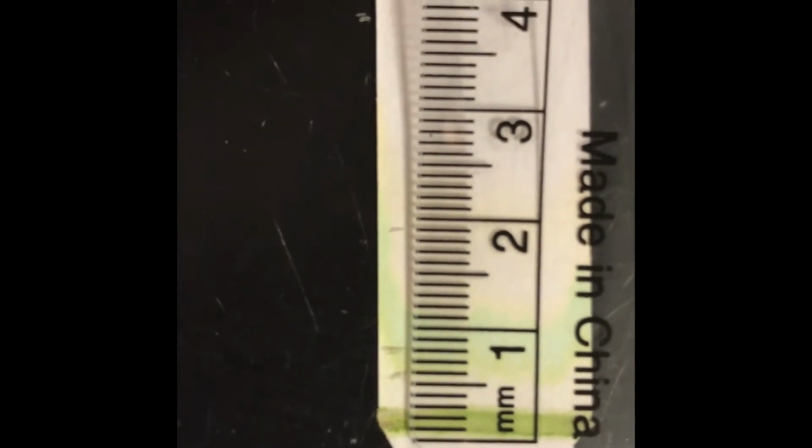Okay, the second one, let me see, 7.5 for the second one. The third one, 15, 16, 17, 18, 19. And then the last one, that's 1, 2, 3. Okay, let's see if we can get it. Okay, the last one up there is 65, 66, 67. Looks like 67.5 for that last one.